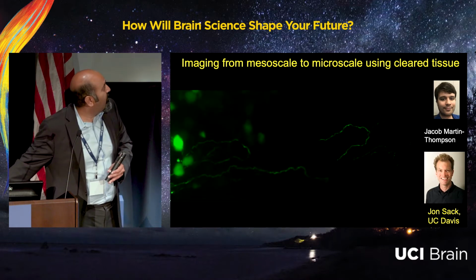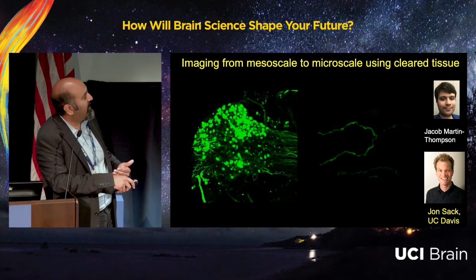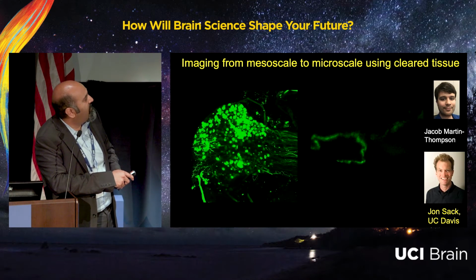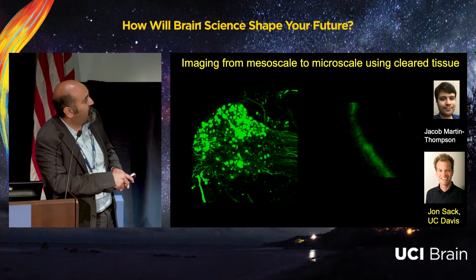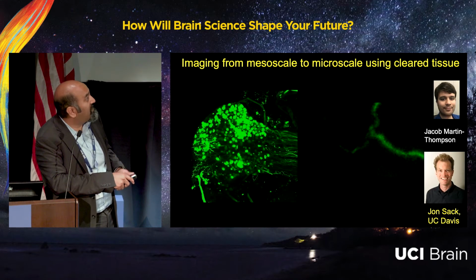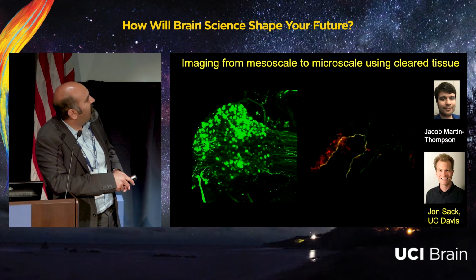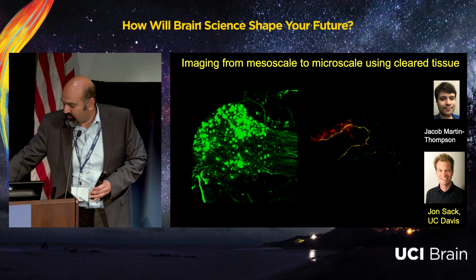and then we can look at the same movie now, the same data sample on the confocal system that's sitting next to it in the optical biology core, this very same T-junction here, now with confocal resolution, and we can molecularly interrogate that using a stain for a particular ion channel that you'll see will turn on in a second, that together tells us that this particular T-junction, buried deep in this structure, is a nociceptive fiber. It's a pain fiber. And this kind of traversing between the micro to the meso scale is something that we now can do, and its potential is, I think, quite vast.